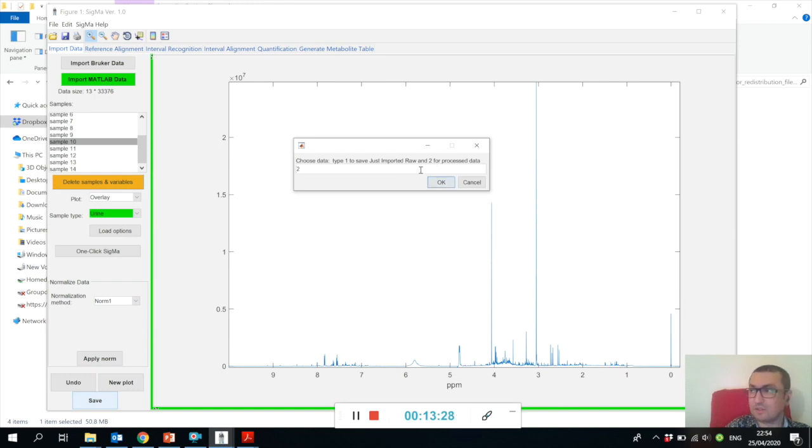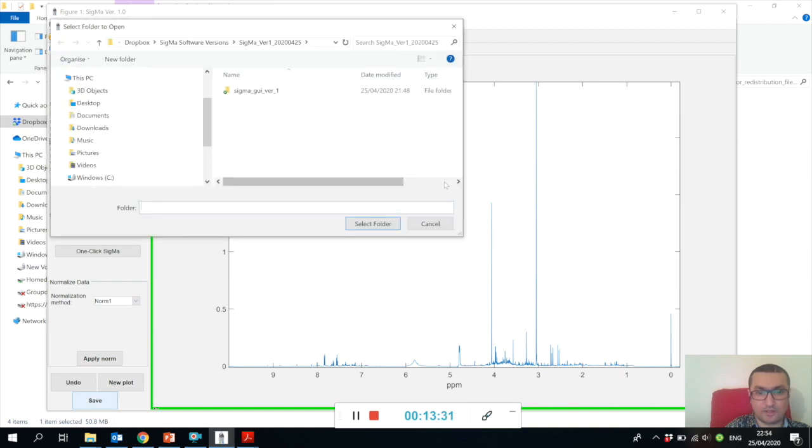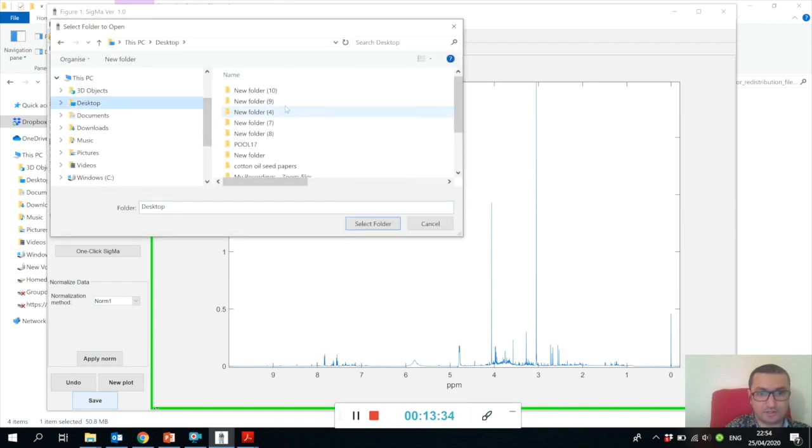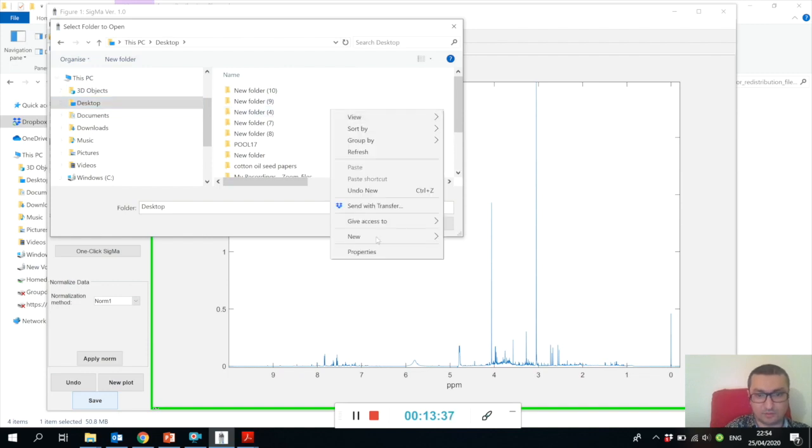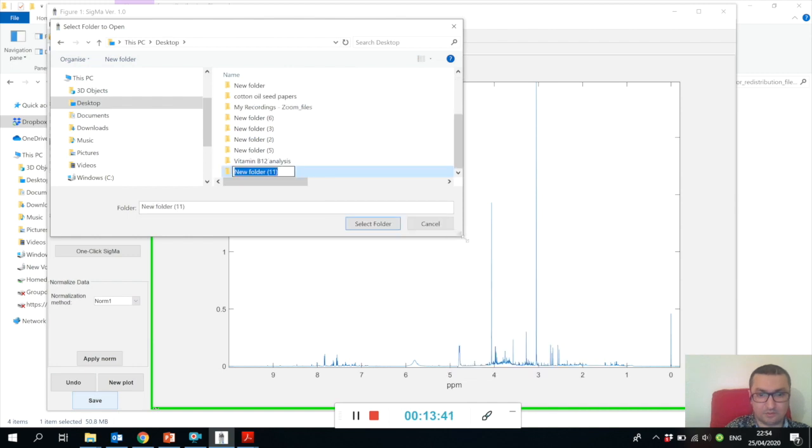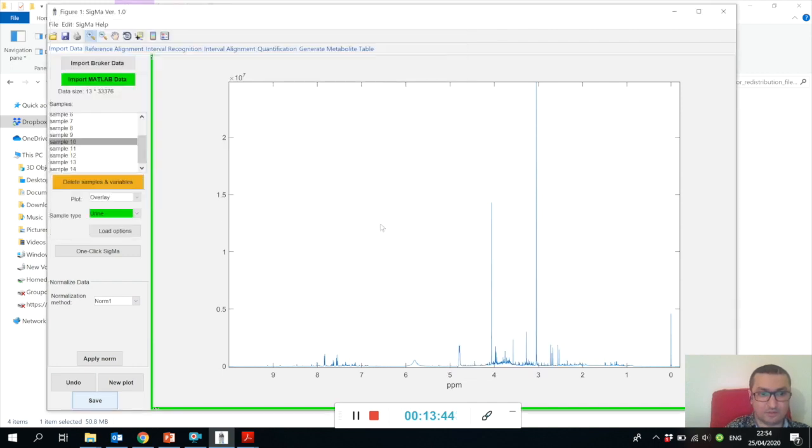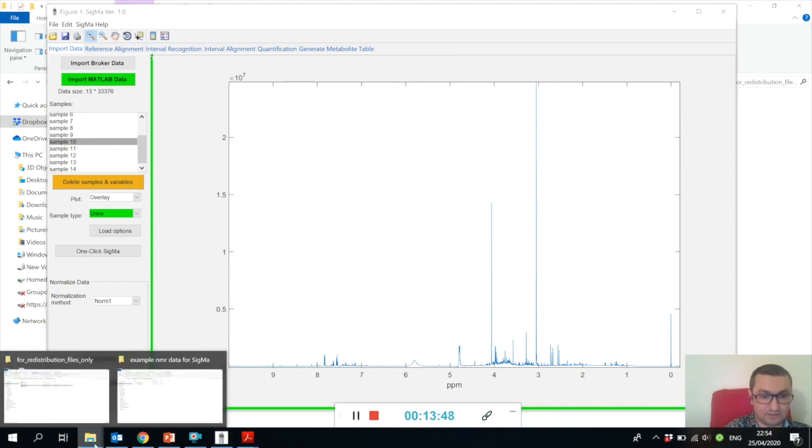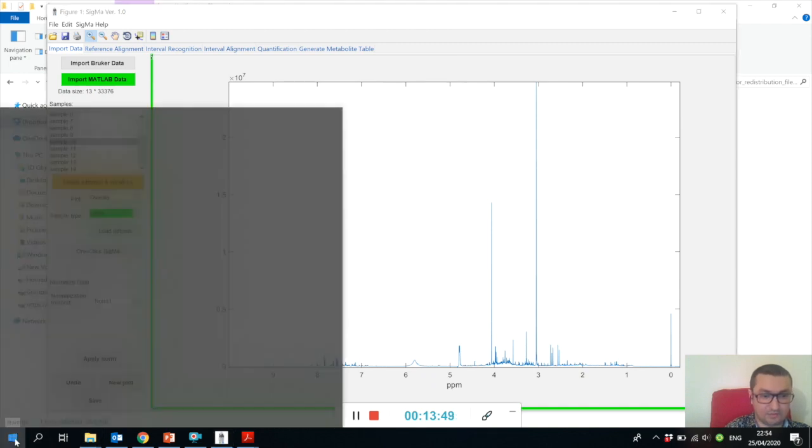While this is orange, there is a button called Save that is active. This means you can save either the just-imported raw data by typing one, or processed data by typing two. Let's say we want to save the processed data - we type two and say OK.